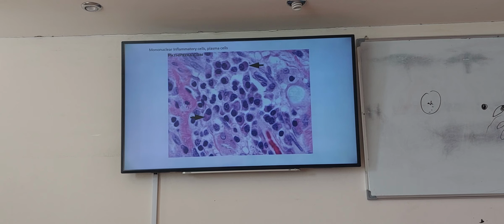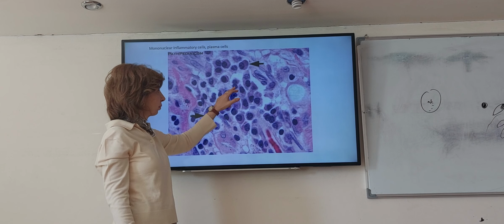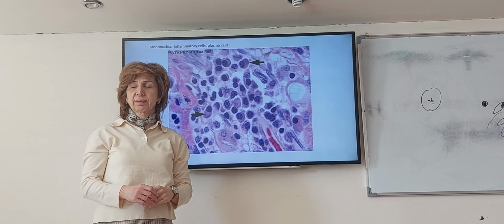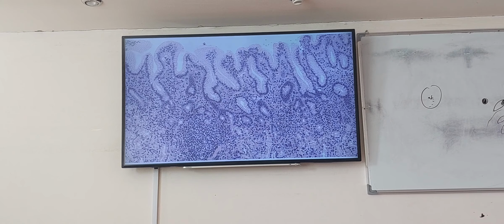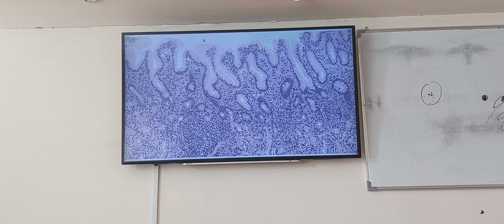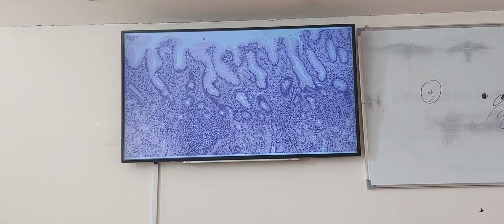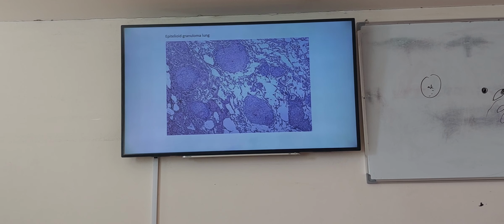What are the cells? Specifically, tell me. Plasma cells. Lymphocytes. What do I have? Another one. Which inflammation, chronic or acute? Chronic. Okay, till here.